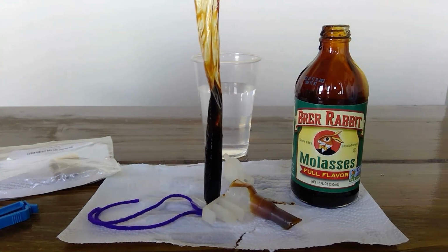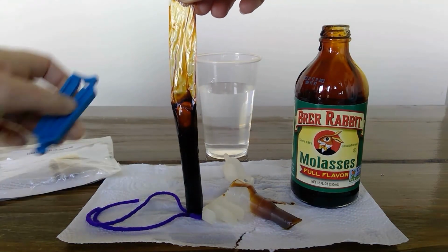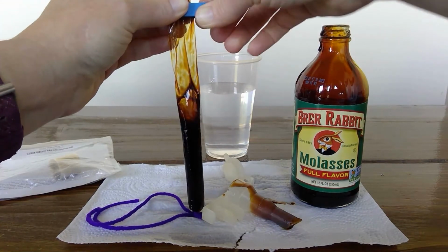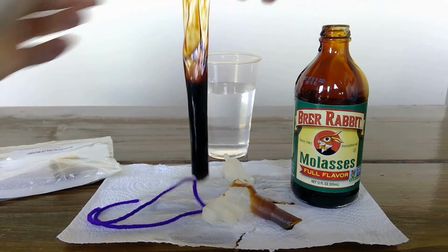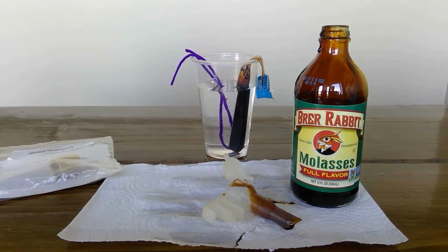So there is our tube with molasses. Notice we have some empty space up at the top here. I didn't fill it all the way. And we'll put the clip on. Okay, and then this goes into the cup of water. And we're not going to add anything to the water. We're just going to leave it as plain water this time, and then come back in half an hour and see what has happened.